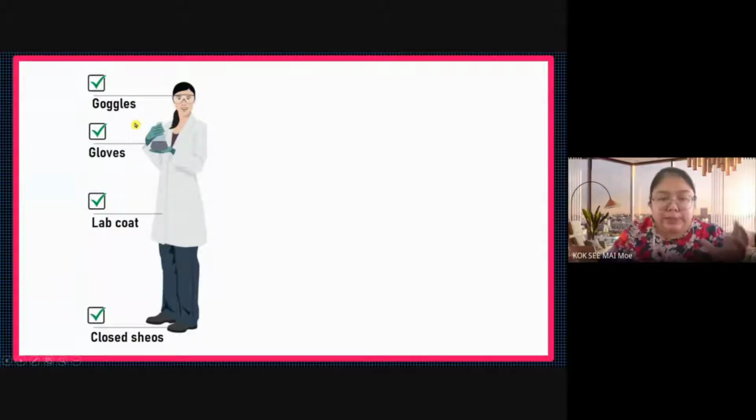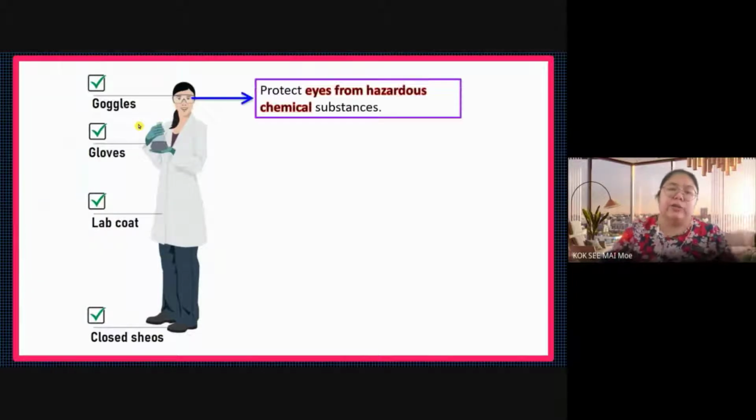They're just like spectacles. The function for this one is to protect the eyes. Common sense, you know, protect the eyes from hazardous chemical substances. Not only chemicals, maybe you want to burn something or hit something, they can also cover your eyes.